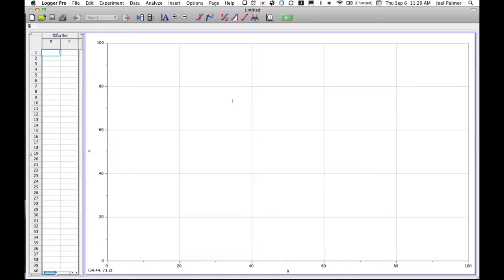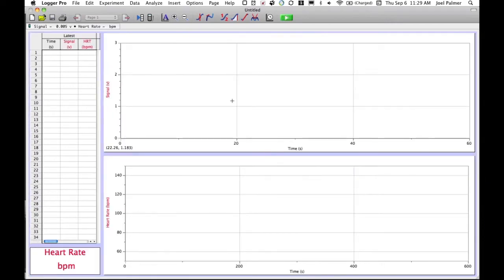I'm going to hook it up and see if we can get it to work. The software has detected the new probe and it has the signal and the heart rate. The signal is the actual pulse, so when we start collecting data you'll notice that on the signal you'll get spikes. If you're not getting spikes, you're not picking up data. The heart rate at the bottom is actually measuring the heart rate.